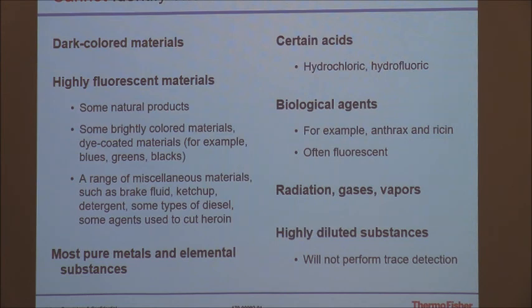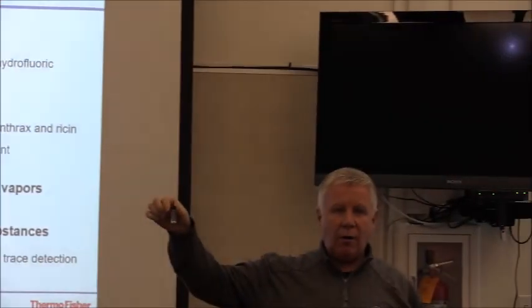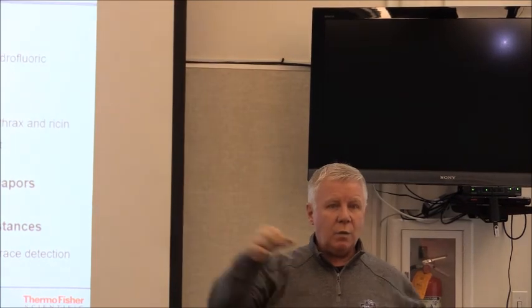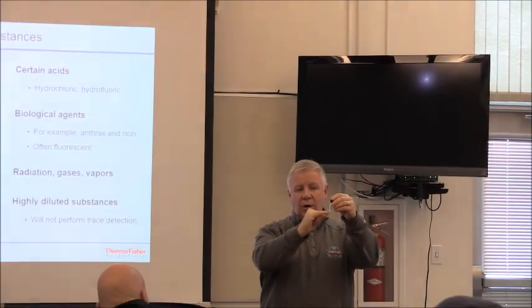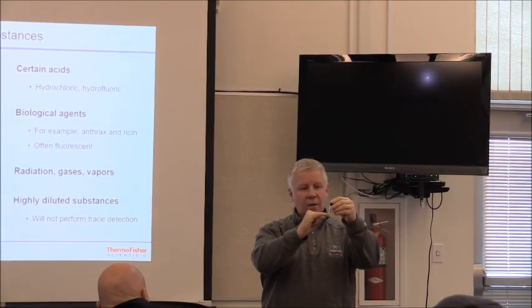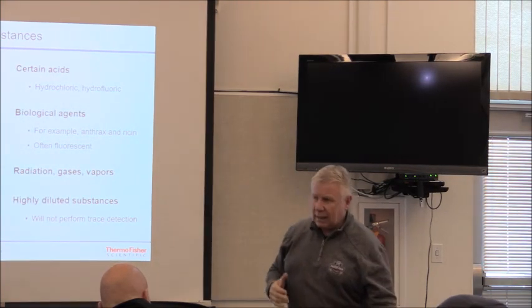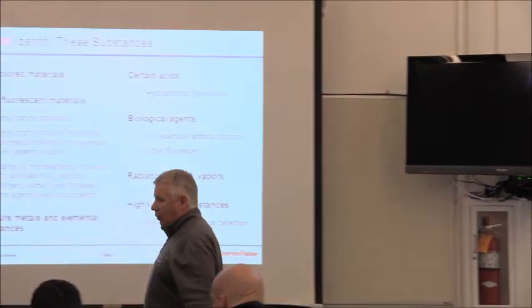Second thing, when these go into those vial holders and you're shooting it, how much product do I have in there compared to the space of the vial? That's enough product to get a sample, because when the laser goes in, it hits right at the very bottom. So I don't have to fill these things all the way up. Keep that in mind when we run samples.